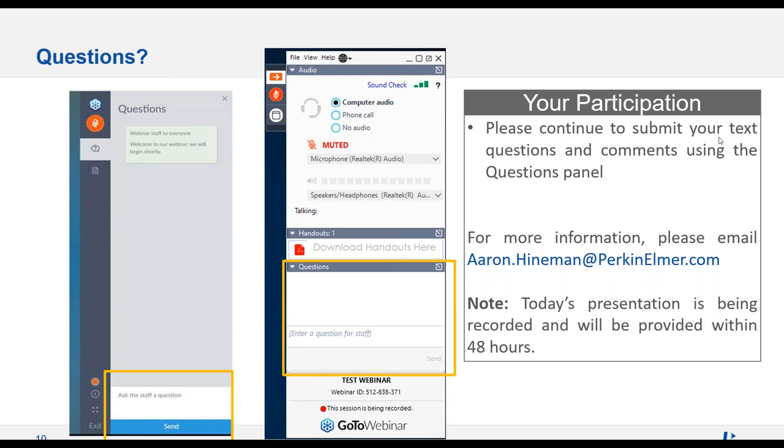Another thing, when I was doing some isotope ratio work, again, it's been a few years, I was using collisional dampening in the cell too, to help normalize the ion beam as it's coming through the cell. So that sometimes hurts. The problem with lithium being a low mass, though, is you'll probably lose a lot of sensitivity doing that. Yeah, and that's something we definitely wanted to avoid, because it was really also about how low can we go.